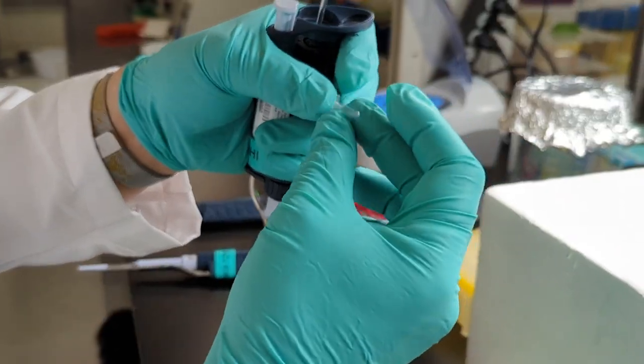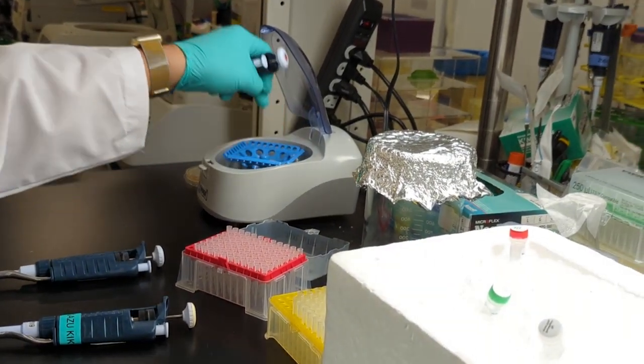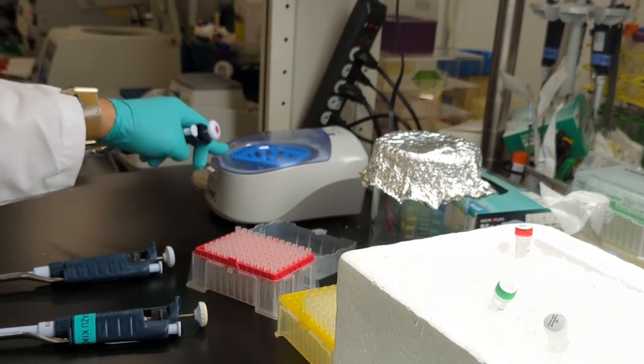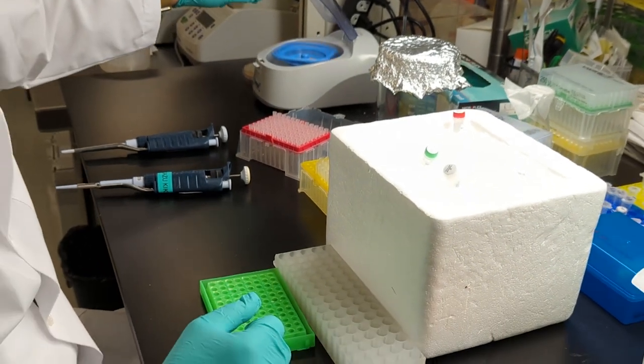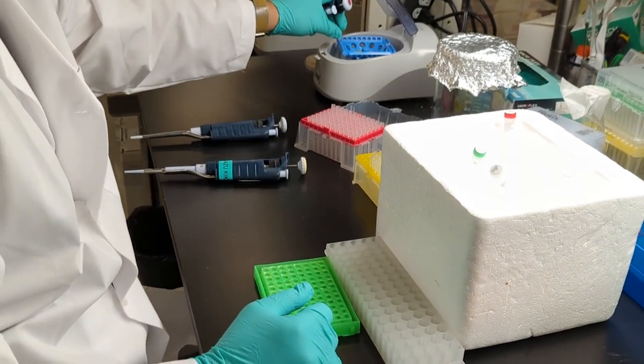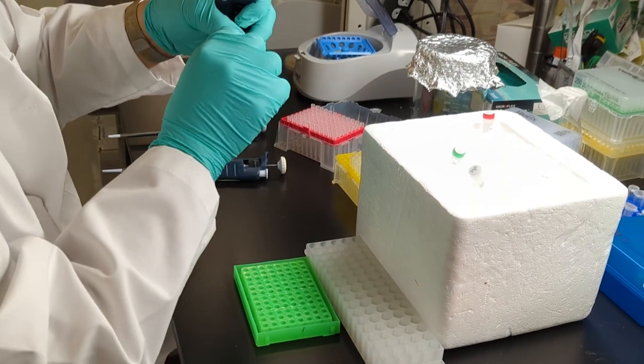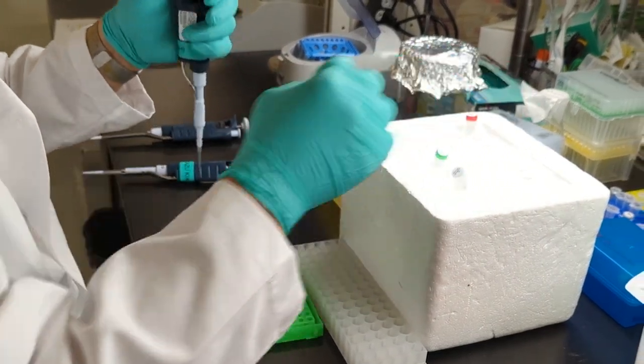The Quick 10 cloning kit assembly mix allows for exceptionally short assembly incubation times. Incubate the reaction mixture at 37 degrees for just 7 to 15 minutes, then place on ice. For larger DNA, longer incubation times may be necessary, but do not exceed 30 minutes.